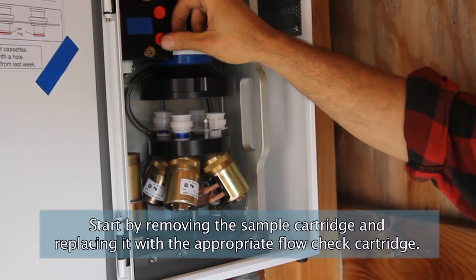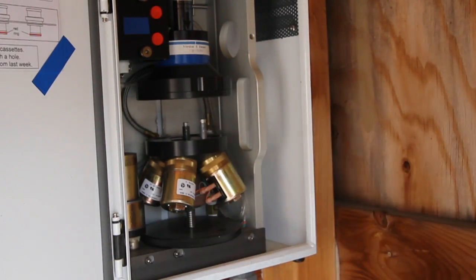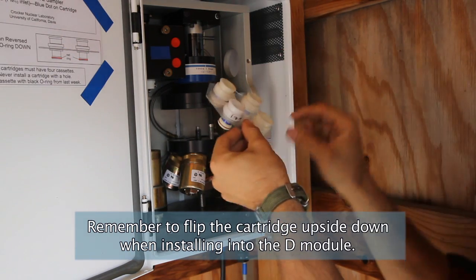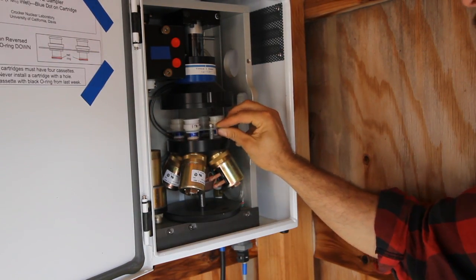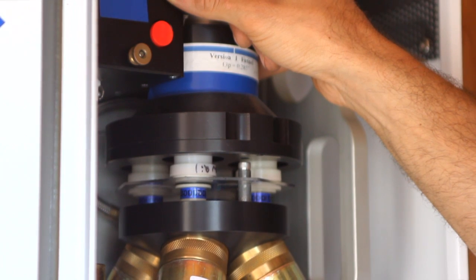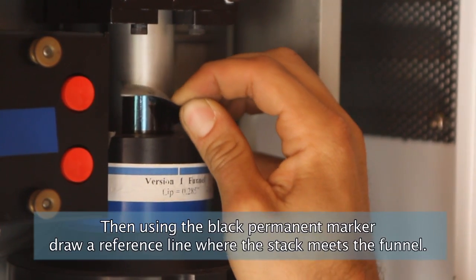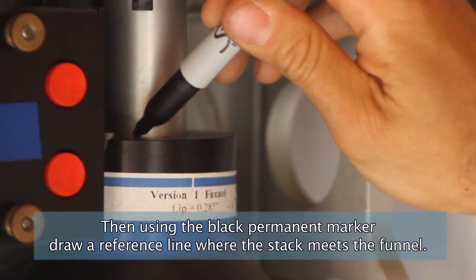Start by removing the sample cartridge and replacing it with the appropriate flow check cartridge. Remember to flip the cartridge upside down when installing into the D module. If there is a sticker on the stack, remove it. Then, using the black permanent marker, draw a reference line where the stack meets the funnel.